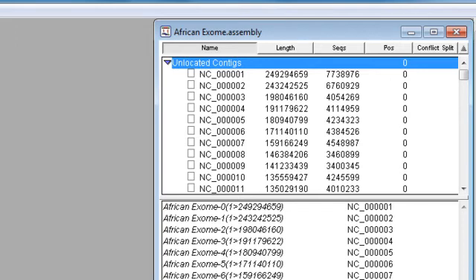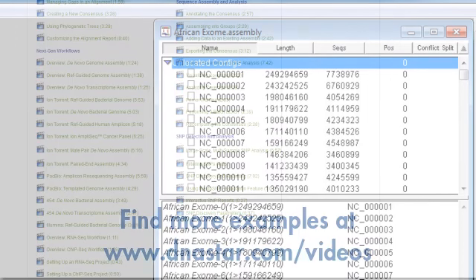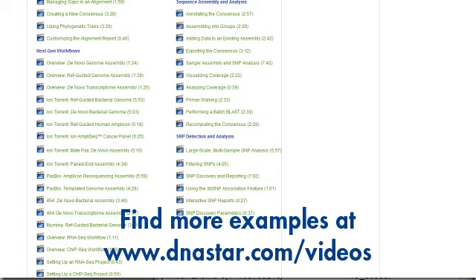However, all of the things I'm going to show you here apply to other assembly types as well. You can see more videos showing how to assemble and analyze data from different sequencing technologies and workflows on our website.